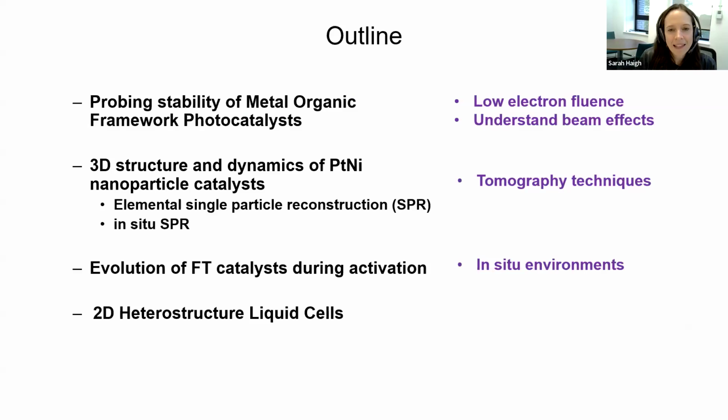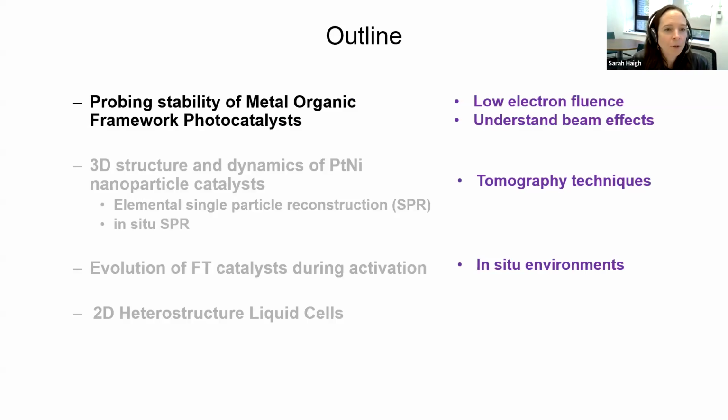So in my talk, I wanted to tell you just some brief examples of how we are trying to apply techniques which require us to use some of these different approaches in order to be able to get closer to being able to study catalysts at atomic resolution in 3 dimensions and in realistic environments that the catalysis operates. So the first one I want to talk about is around looking at metal organic framework materials.